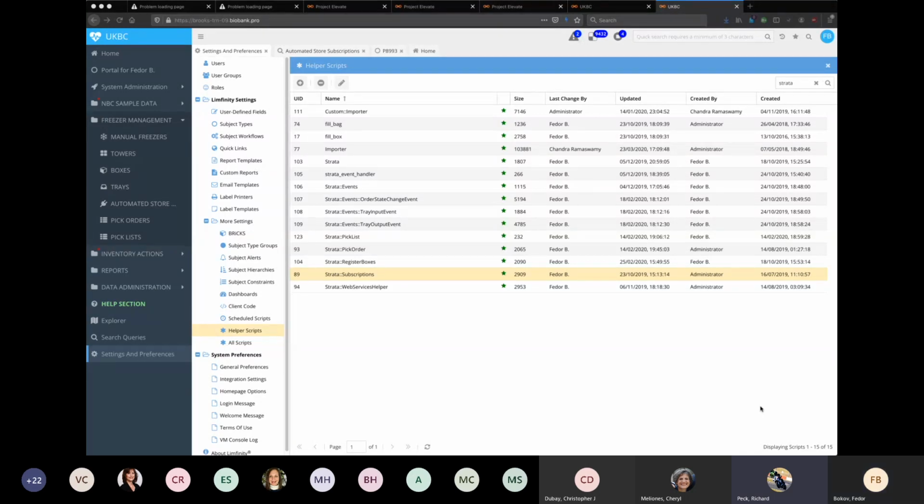So it depends on the size of the store. One thing that we were able to do, and again, a lesson learned going from the old LIMS to a new LIMS: the old LIMS used to store the data for the plates or the boxes within its own database, and the Strata or the store actually had to query an external database. This took a very long time, because as the plate goes in, it's put into temporary storage. It's then taken out and scanned as a QC step. So Strata has to validate that all the samples in the plate match what should be there. And when it was scanning 6 boxes on a tray and having to read the data from an external database, this was taking an awfully long time.